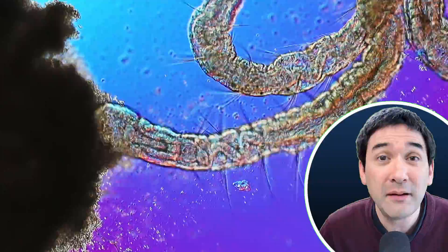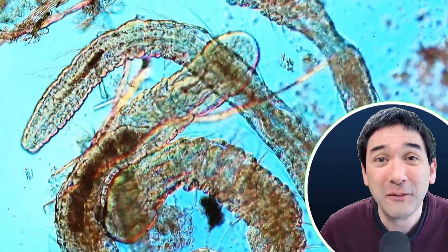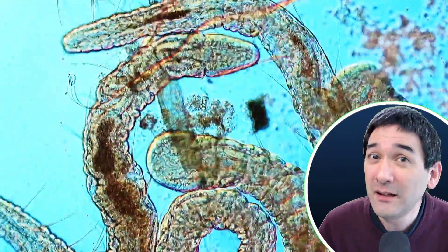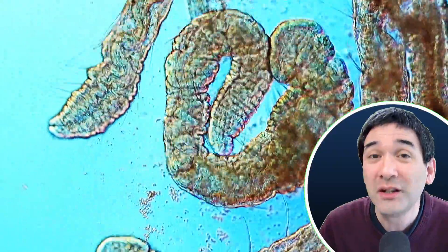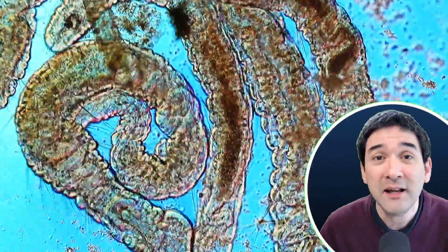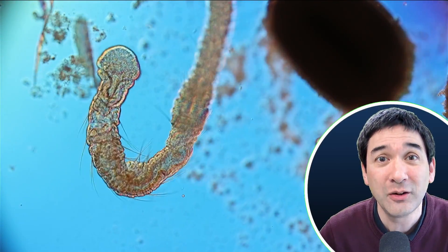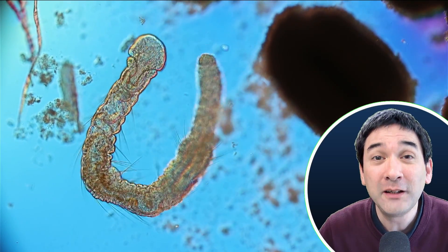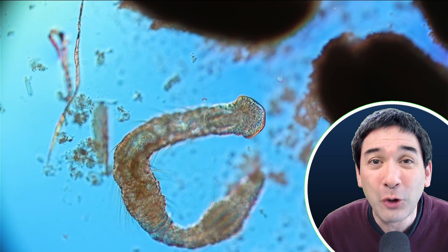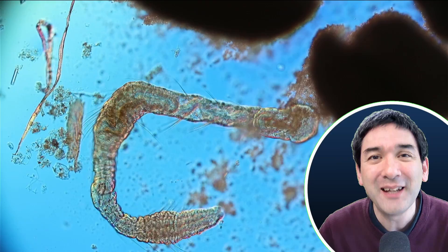What I did next was take the worms and put them back into the jar, allowing them to digest the food quietly back with their little friends on the window. This basically means these worms are probably going to start reproducing now. What they do is they will start to fragment — they reproduce asexually, meaning one long worm splits into two, and then you have two worms. They do that quite efficiently and quite often. That's all for today. Hope you liked the video. If you have any recommendations or wishes for what you'd like to see under the microscope, please leave comments. I'll try to follow up on that. Happy microbe hunting — see you around next time!